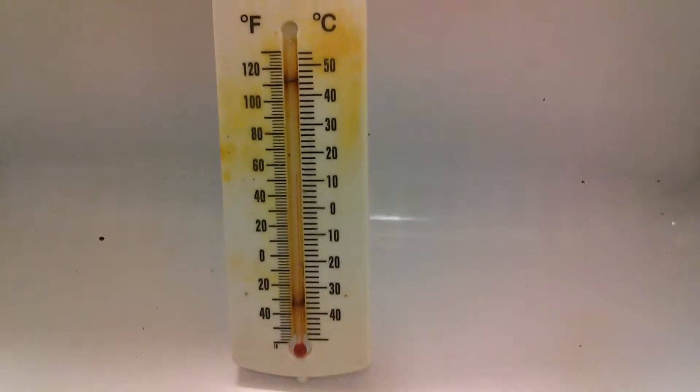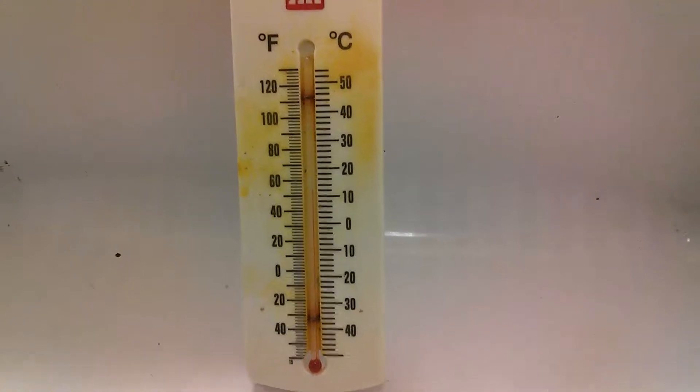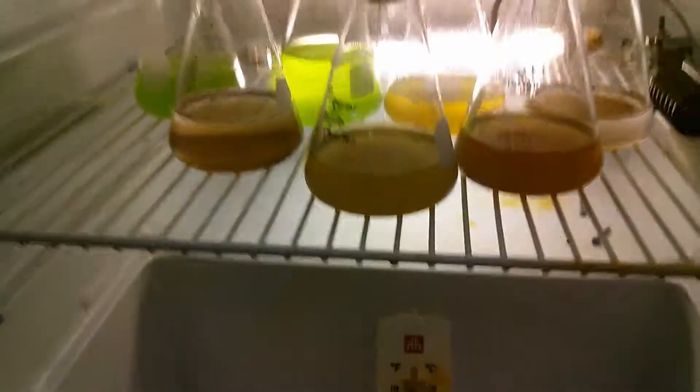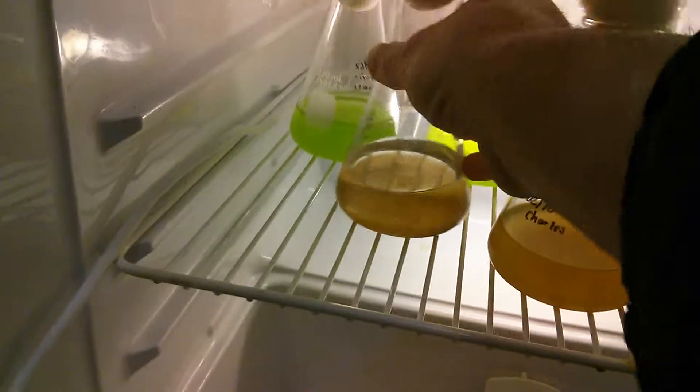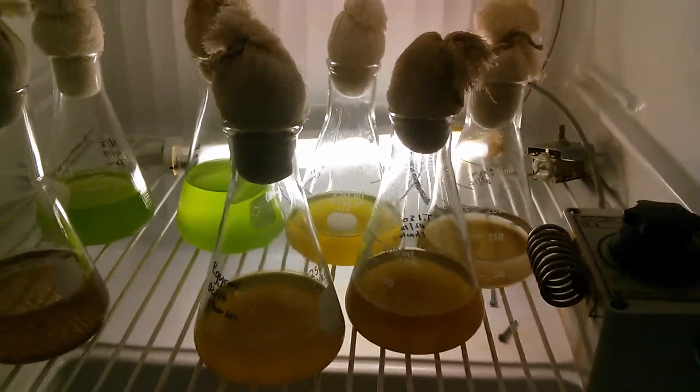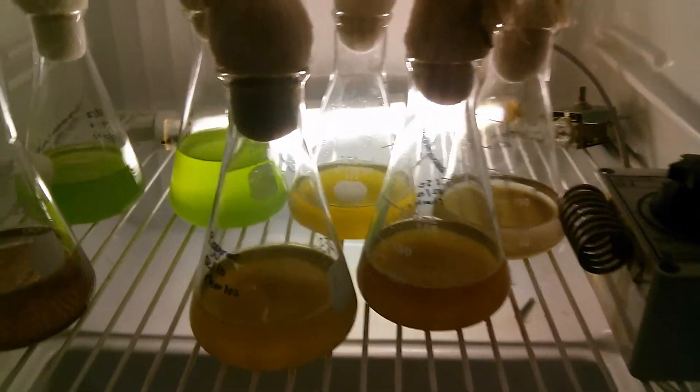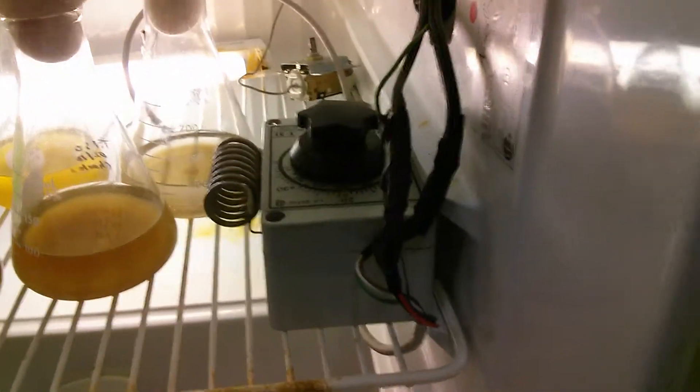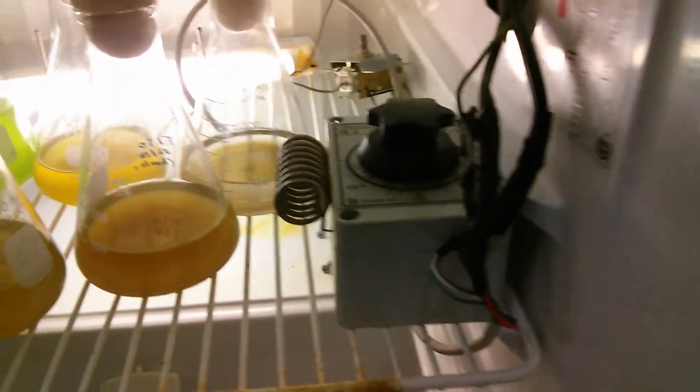You always keep a thermometer in there to get a decent idea of what's going on. So we're running at around 12 degrees Celsius. The light actually produces most of the heat that's required in there, and this will come on to keep it cool whenever it gets too warm.